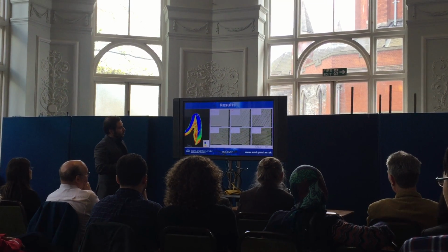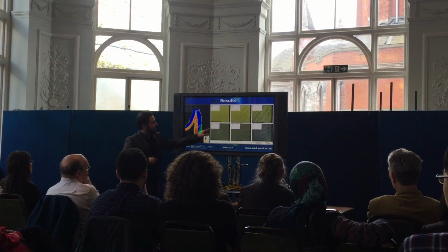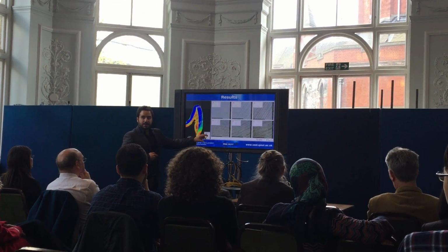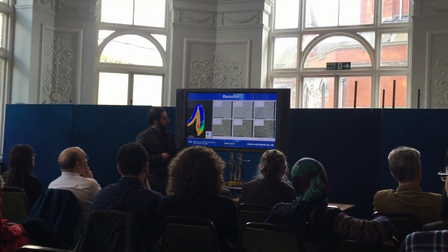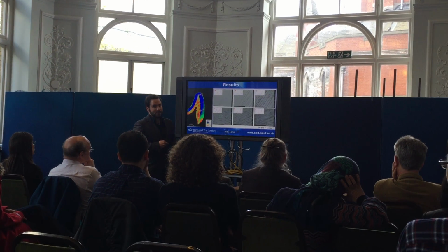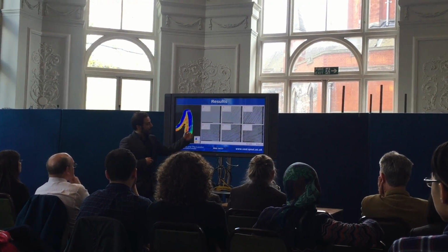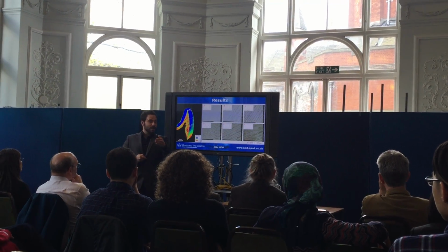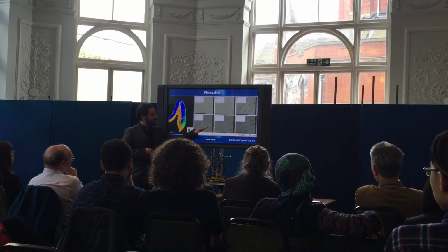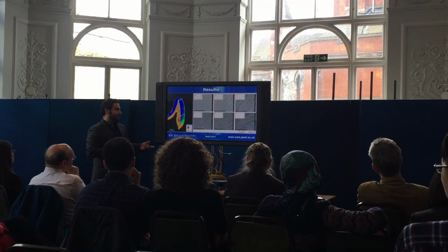Now, I want to concentrate on D for the moment, and you can see here, D has the 4 pronounced peaks. Look at the SEM image, how it's different from the rest. Now, these lines here are the prism boundaries. In here, you see some prisms that are facing you, the lovely audience, and another reflection, the other prisms are facing the other direction, perpendicular to that first direction.